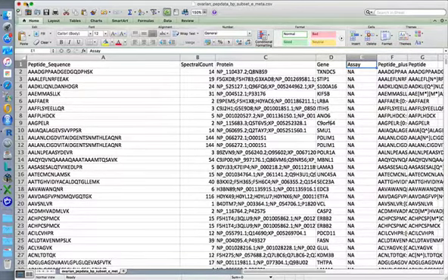The mapping in the metadata information file is also used in the Trelliscope displays to link one identifier to another. For instance, if protein information is included, the Trelliscope displays will include a link to the UniProt webpage for the associated protein, and similarly a link to the GeneCards webpage for the associated gene if gene information is included. A separate video is available on the PMART YouTube channel to show how to upload your own files to PMART.